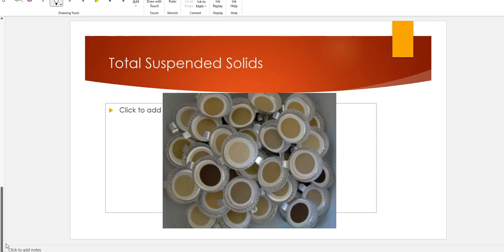All right, so good luck on the pre-lab assignment. Hopefully you'll be ready for the lab when you show up that day. We'll have all the directions printed out for you, and the data sheets are going to be printed out for you. Normally, ideally, we would do these in triplicate, so at least 3 portions of the water will get processed so we can take an average of the TSS and TDS. But for this particular lab experiment, we're only going to do 1 sample portion, and that is it. We're going to be doing 1 round of heating, and that is it.